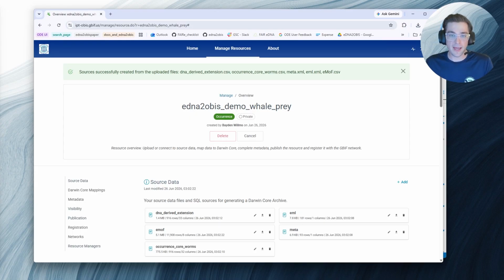I will just say that for things like taxonomic assignment, you're really going to want to review those manually, and you're not going to want your published data to go online without reviewing everything manually. So that's why we've given the HTML report and the taxonomic assignment info report, so that you can check everything and make sure it looks okay. So with that, I'd like to end the tutorial and thank you again.